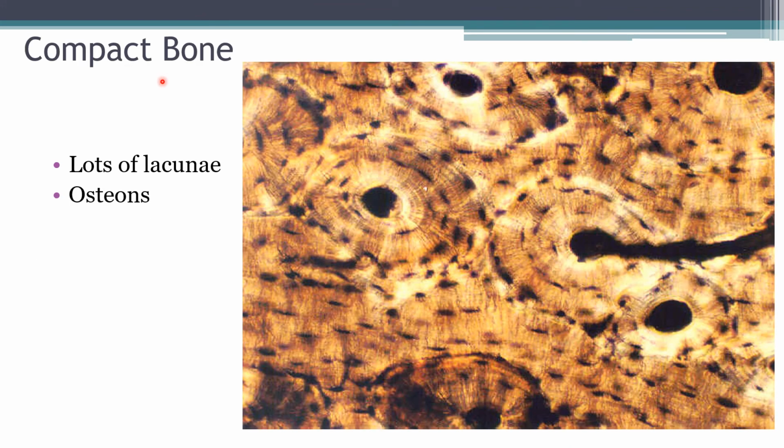Next is bone. Now, the bone that you're looking at here is from what are called ground bone slides, where they dry out a bone and then they grind it up into a bunch of little flakes and sprinkle it on the microscope slide. So in this kind of ground bone slide, you're not going to see any nuclei of any osteocytes or any bone cells because those cells are gone before the preparation occurs.